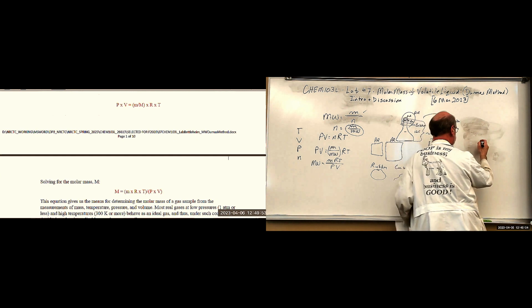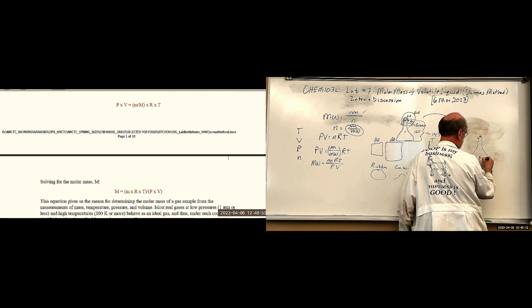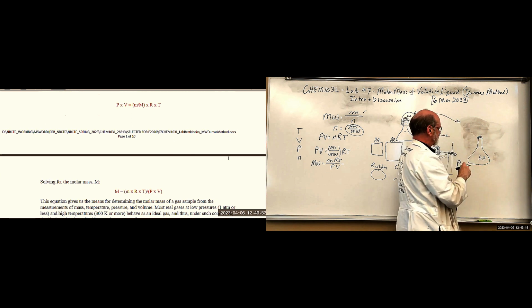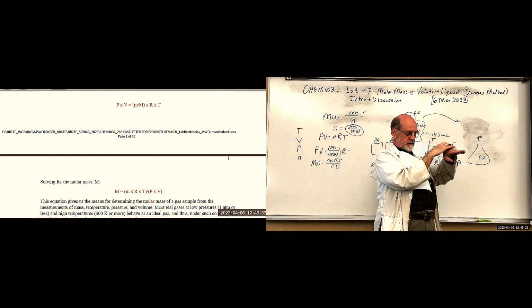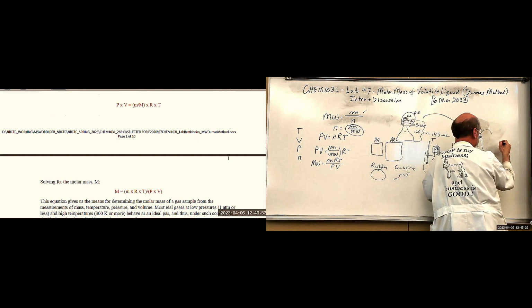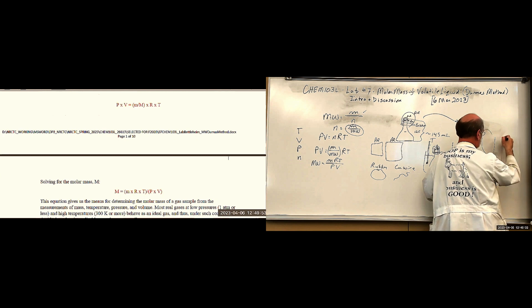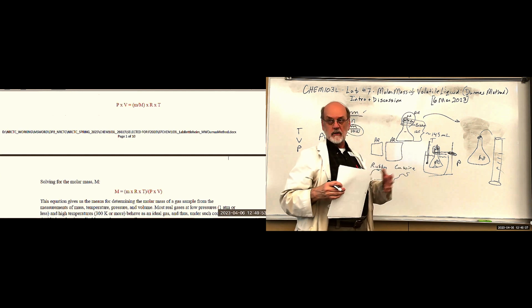You can fill the flask up with water all the way to the top, the same place where the little aluminum foil is flush across the top. That's what you want. And then you can pour it into a graduated cylinder and measure the volume. Okay, that's one way. It's not very accurate, but it works.